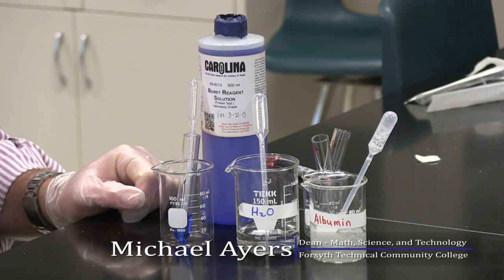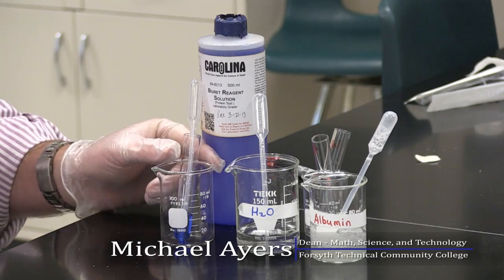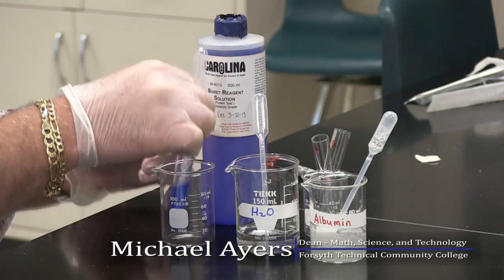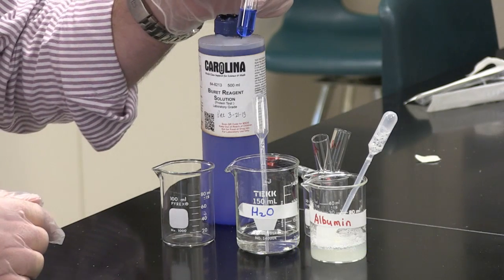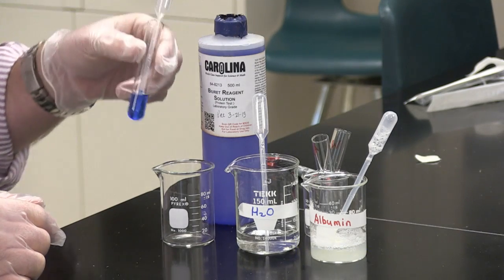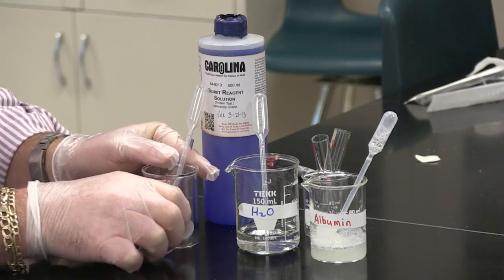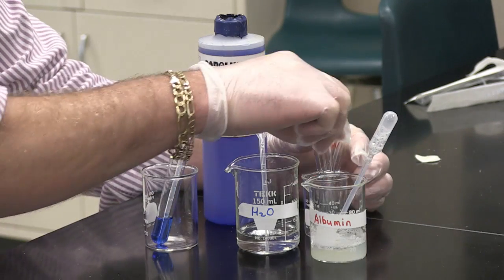Now we want to demonstrate the Biuret reagent, which is an indicator for proteins. You can see that the Biuret reagent is a nice royal blue color. So we will be looking for a color change from this royal blue color during our demonstration.